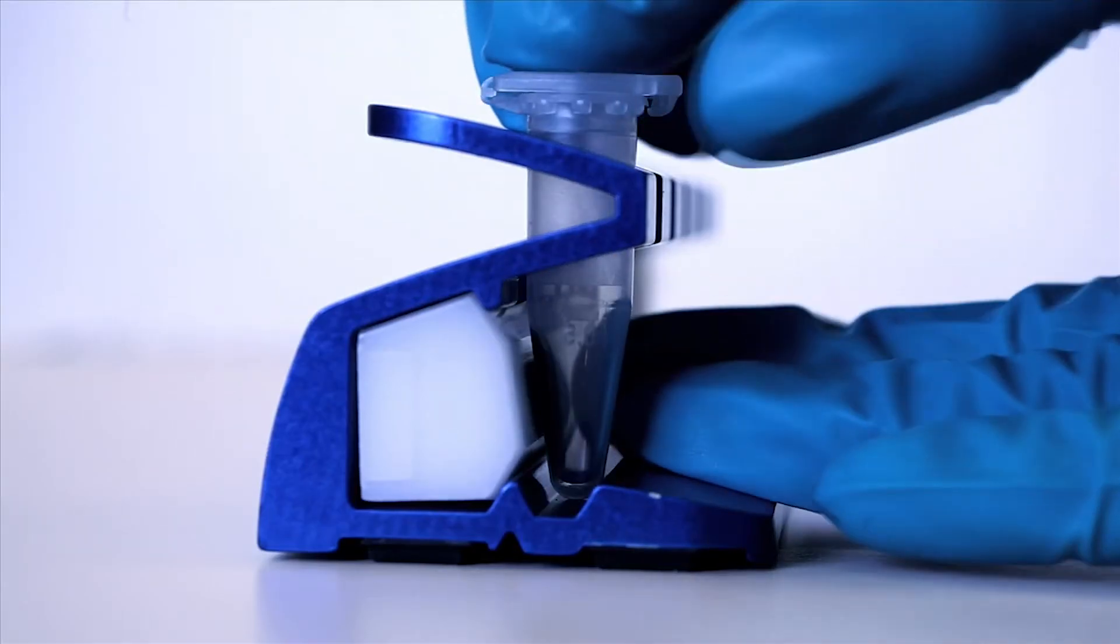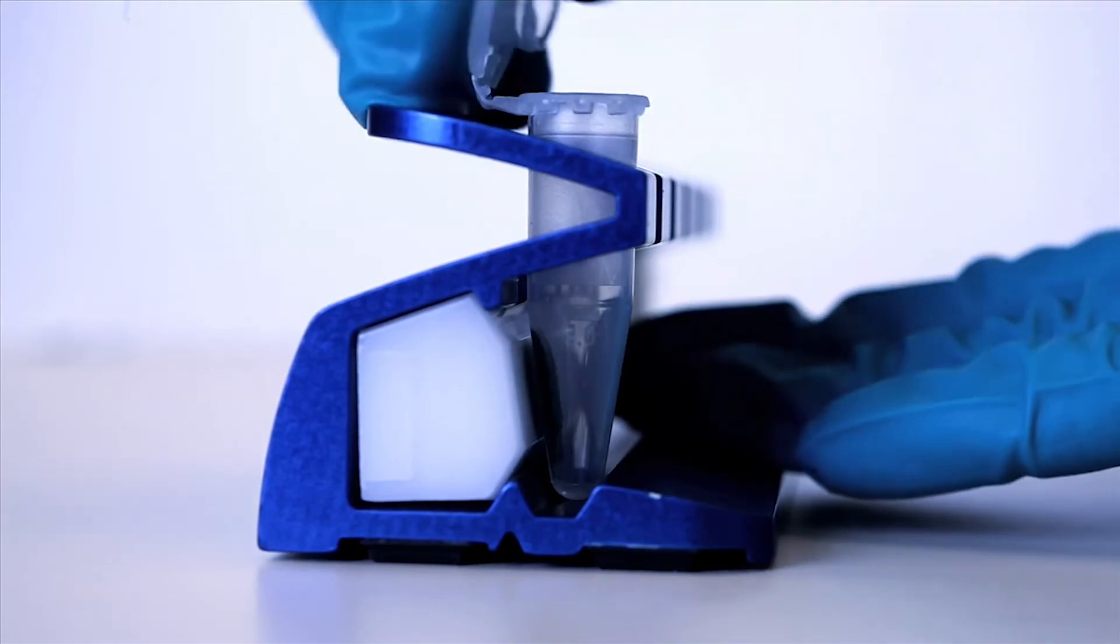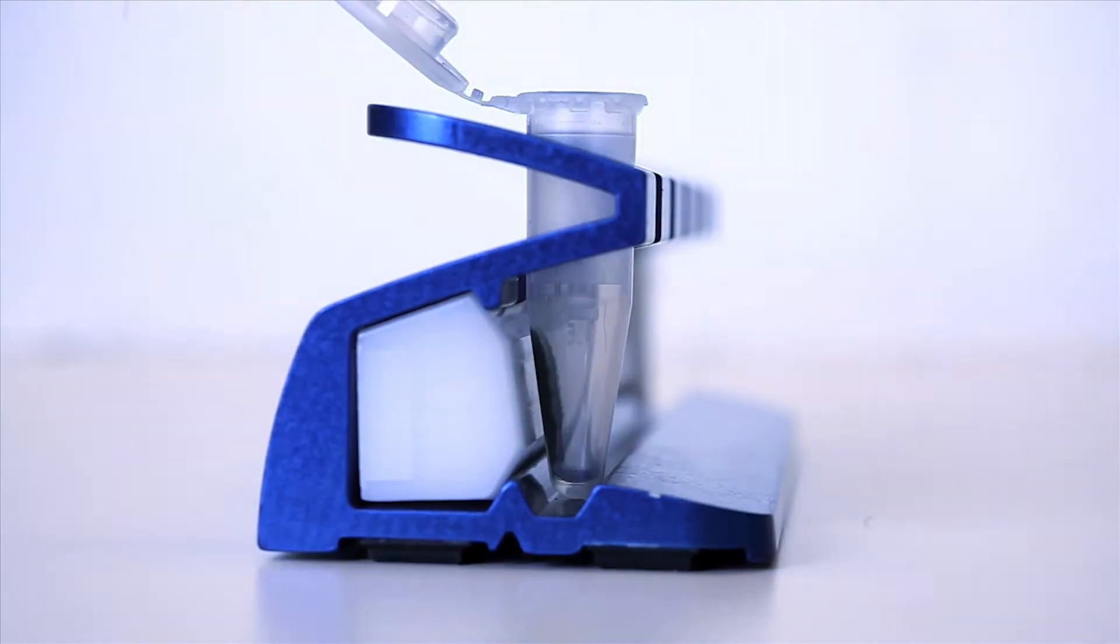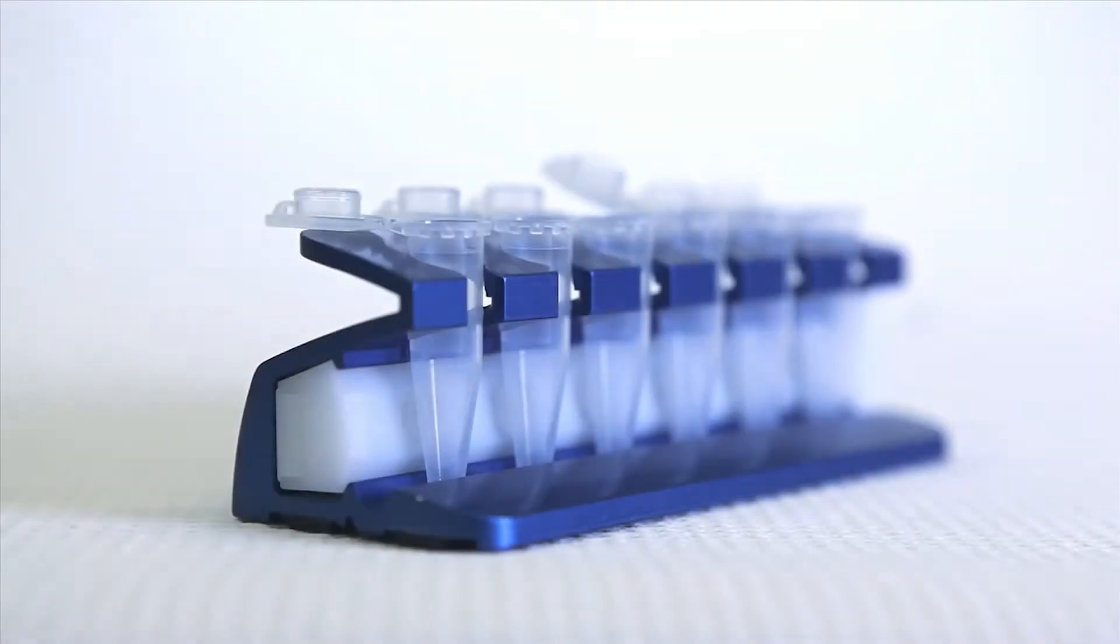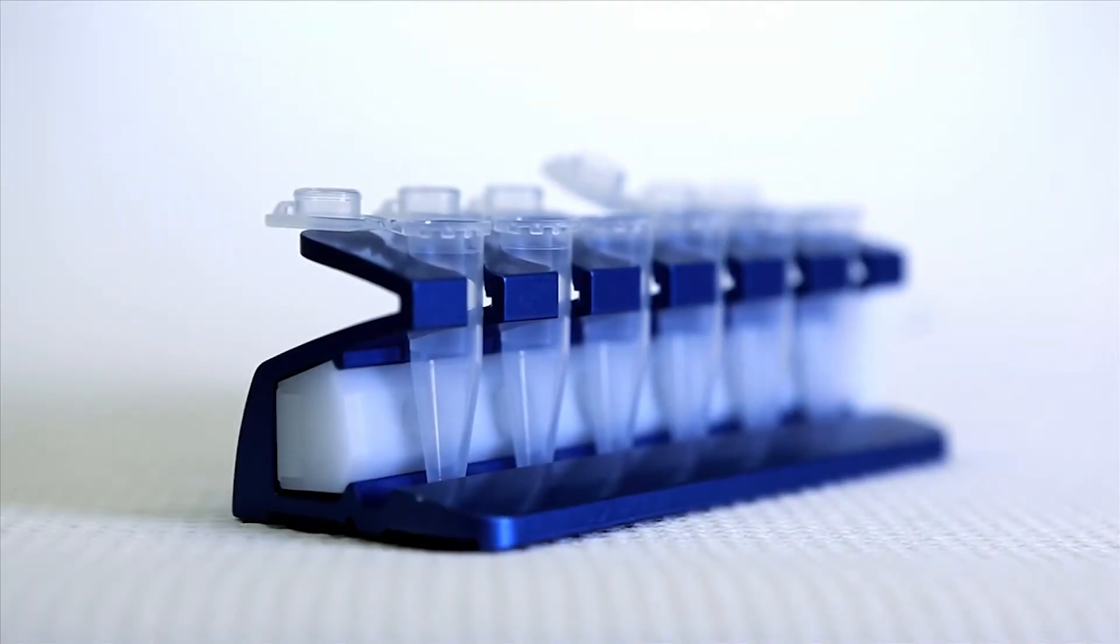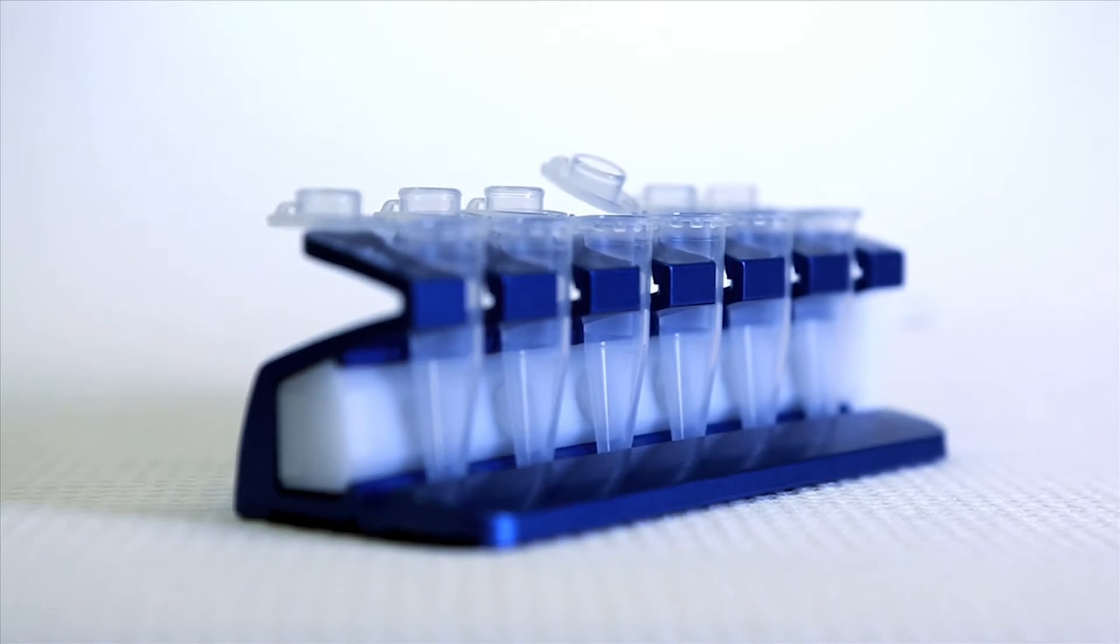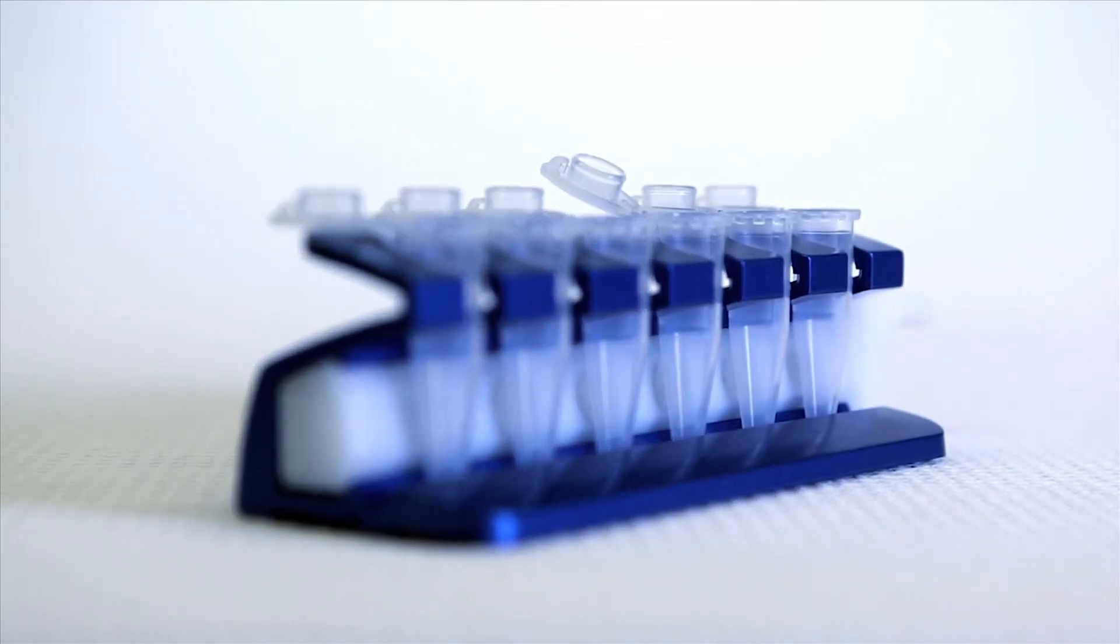MagRack 6, a magnetic rack, is designed for small-scale purification using magnetic beads. Up to six 1.5-milliliter microcentrifuge tubes can be held in the rack and allow multiple separations in parallel.